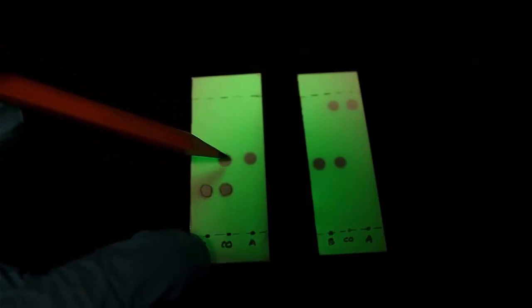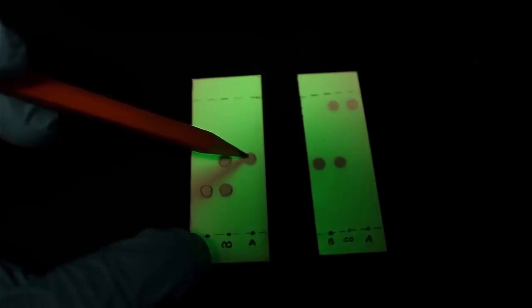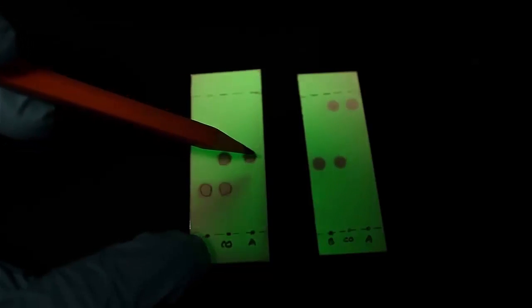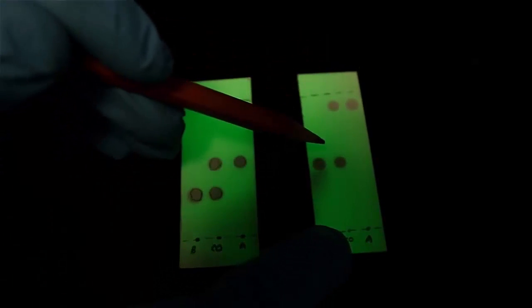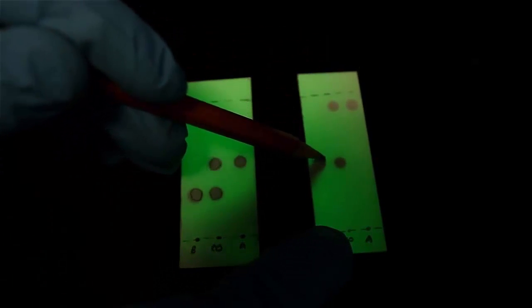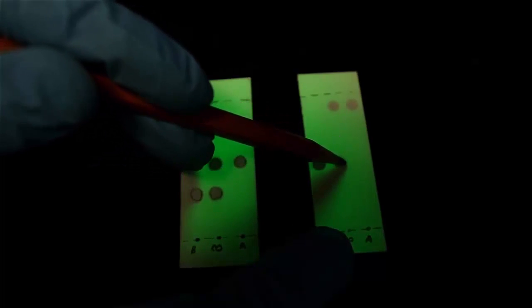The TLC plate can be very useful in determining the purity of your product. Ideally, the product and starting material lane should have one distinct circular spot. The co-spot lane will have two spots if the compounds tested have different RF values. Multiple spots in the lane are an indication of contamination because ideally each compound has its own distinct RF value.